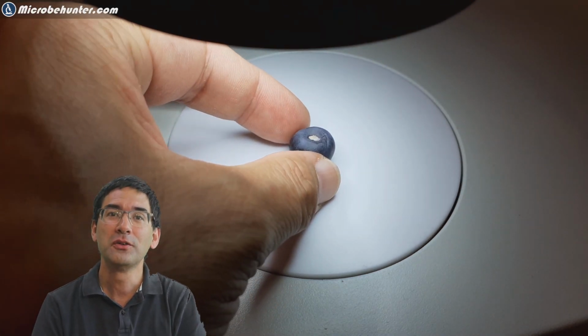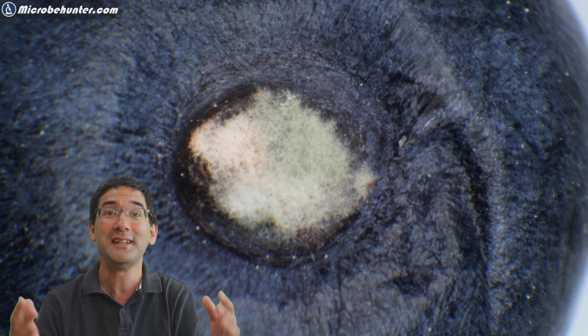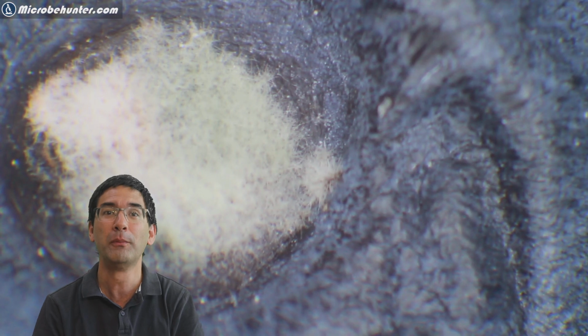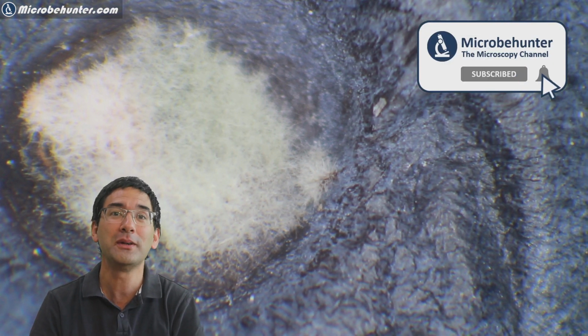I wanted to figure out now, is it really mold? So I put it under the stereo microscope and yes it is. So in this video I'm just going to show you how I prepared the specimen and how I observed the mold and the spores of the mold under the microscope. But actually what I really want to talk about in this video is why you should not eat moldy food in the first place. Well, there are several reasons for this.